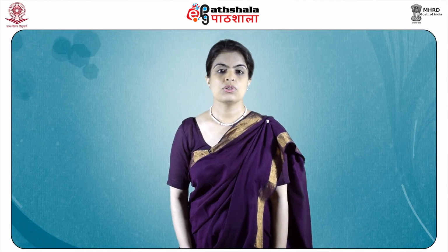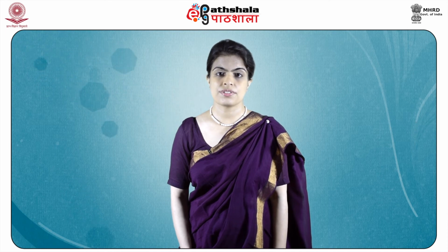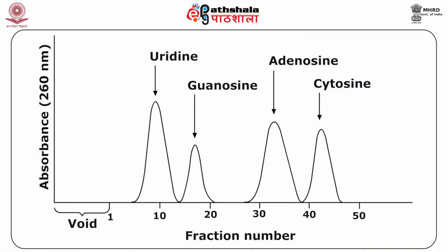At times, good separation is achieved if the binding and eluting conditions are the same. This is called the starting condition procedure. The figure on the screen shows an example of an elution profile from an ion exchange column in which RNA nucleosides are eluted.